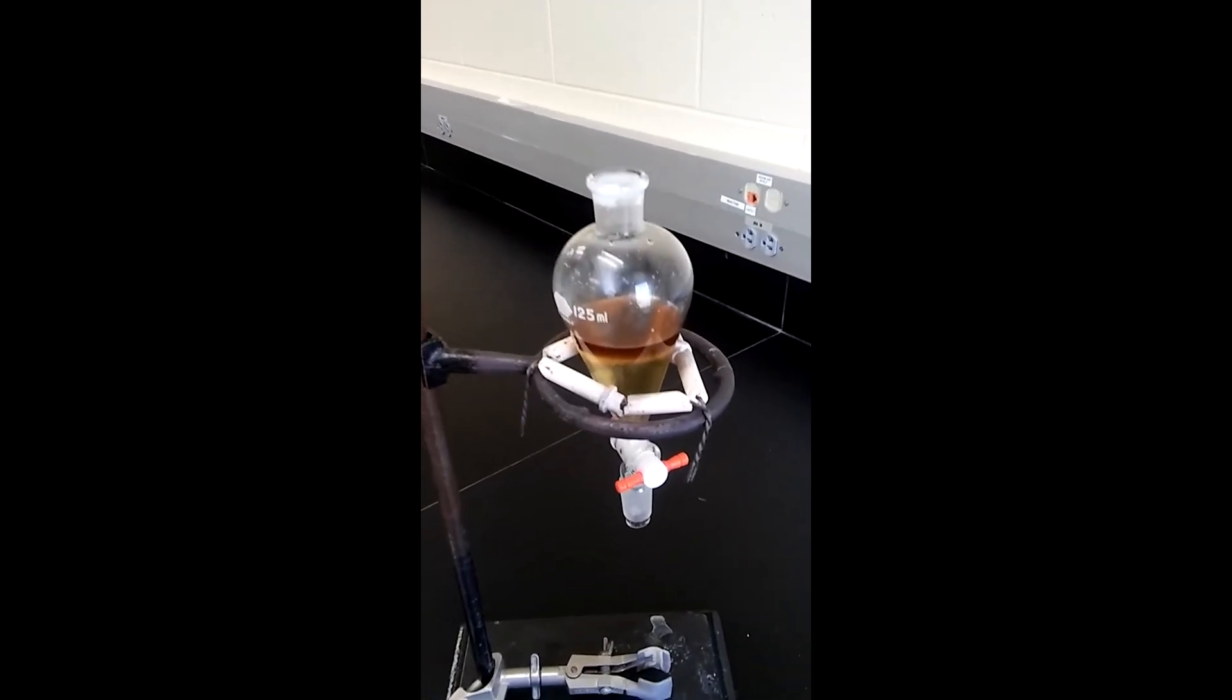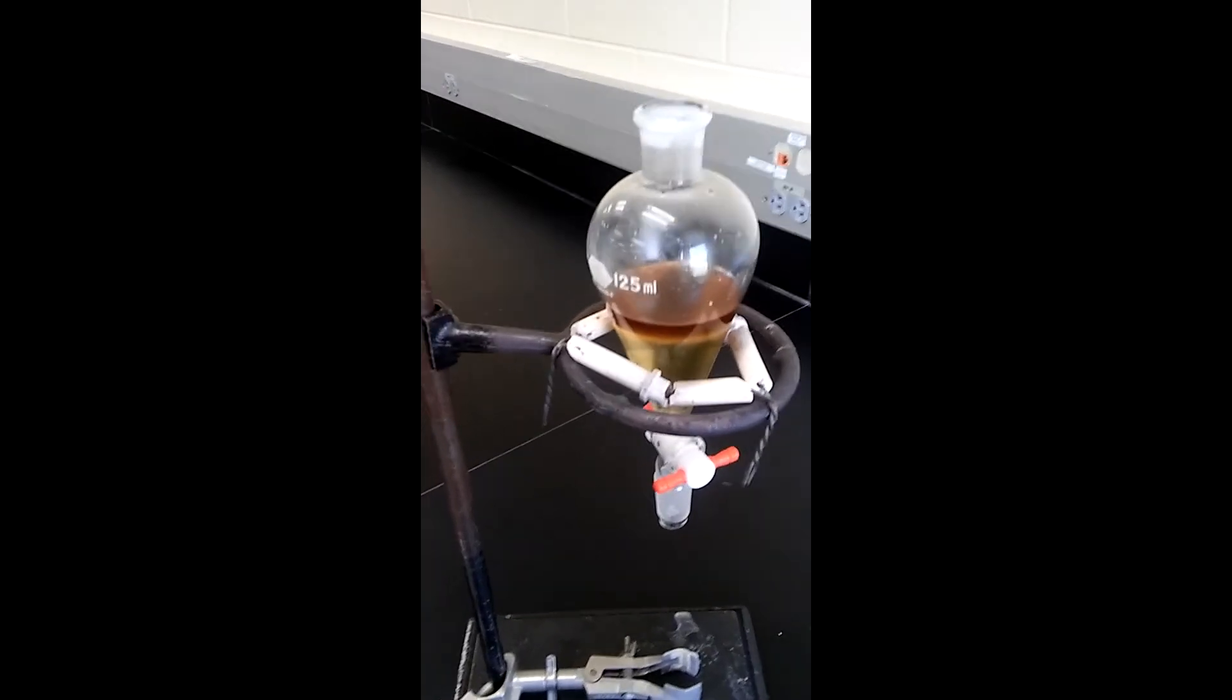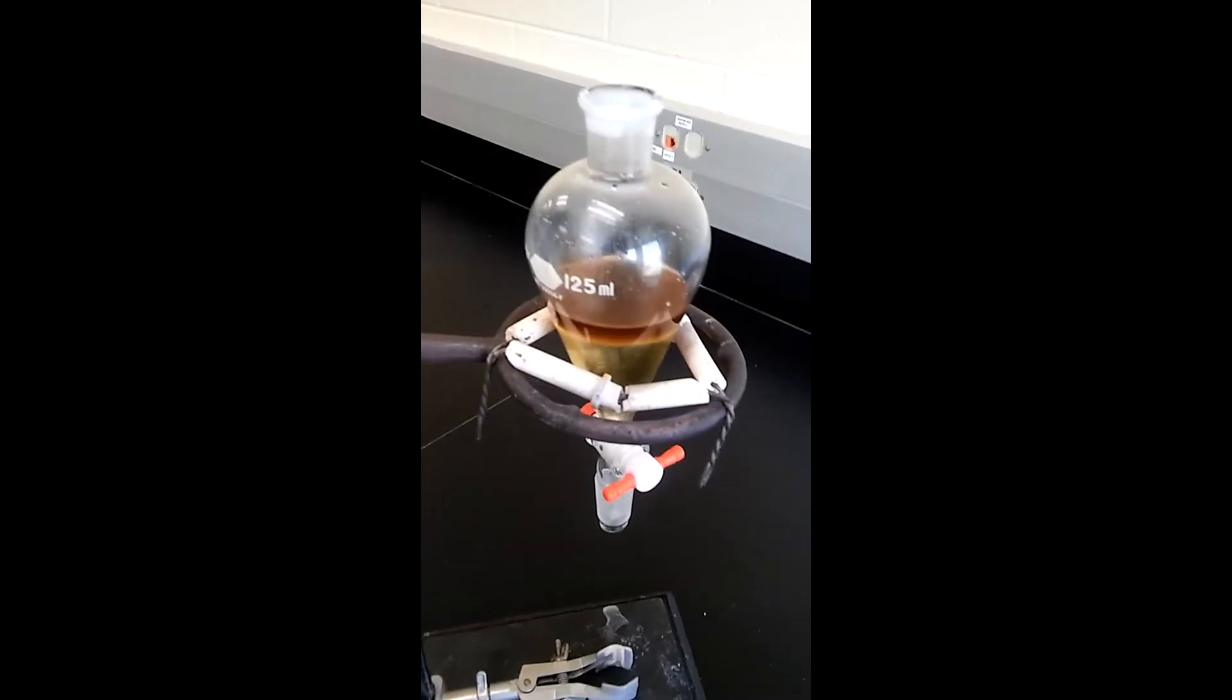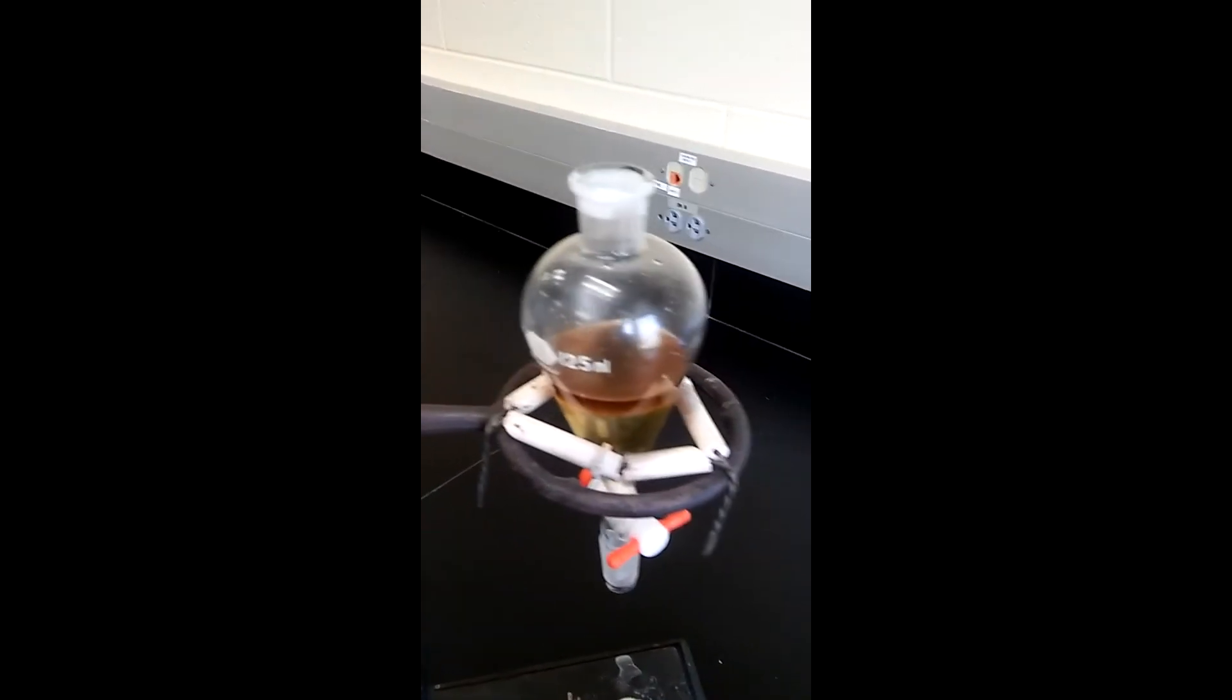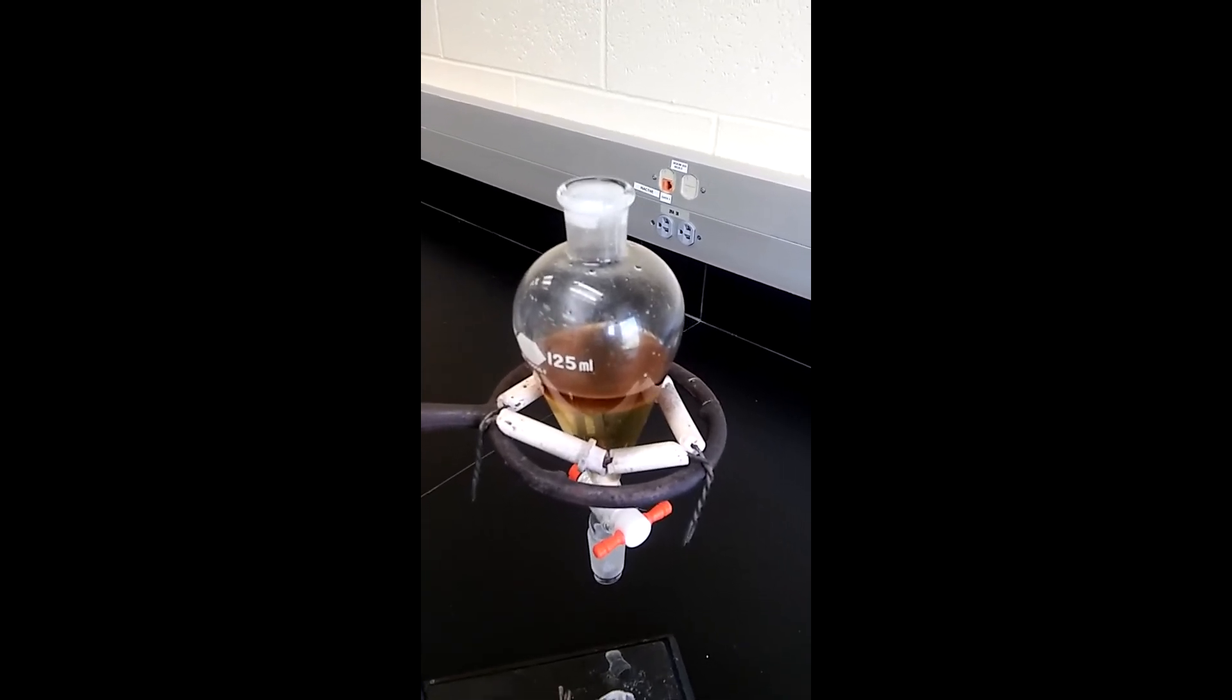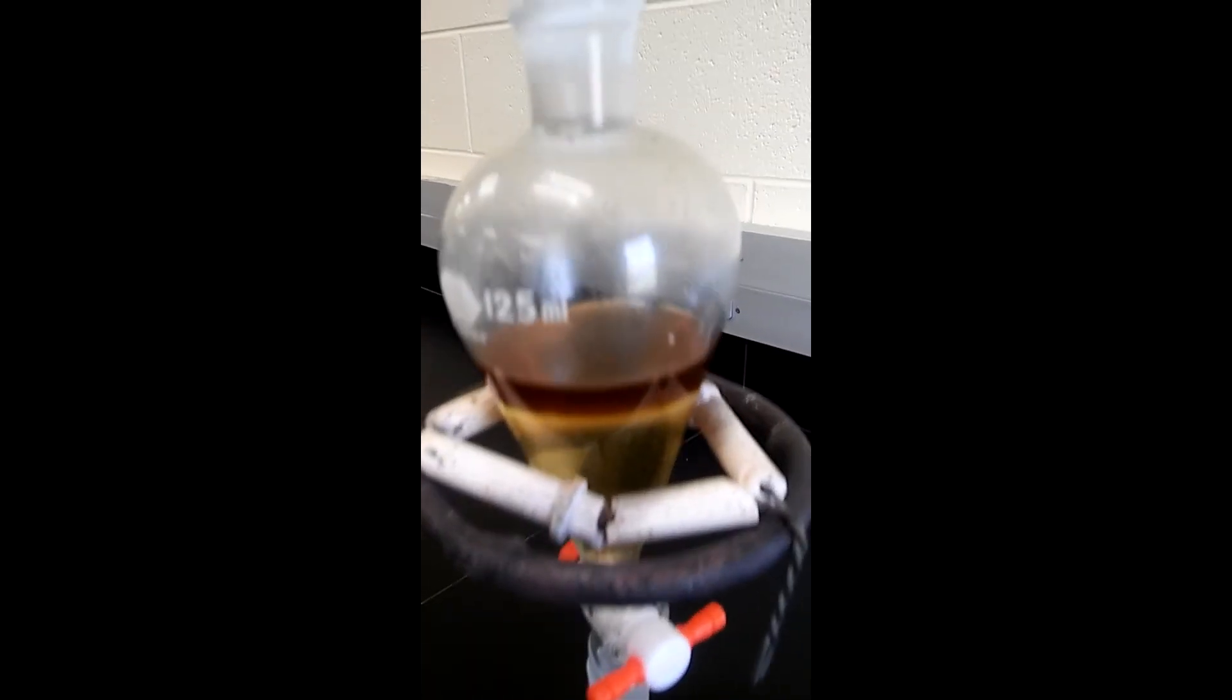I added 30 milliliters of distilled water into the separating funnel, and I also added just a little bit of distilled water into the round bottom flask to get rid of any traces of the product. Then I poured it back into the separating funnel. Now I'm gonna shake it, and then allow the layers to separate.